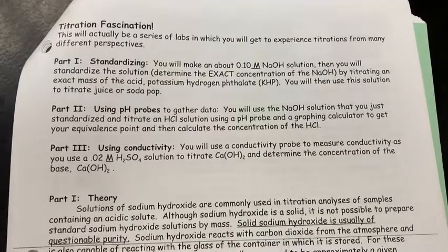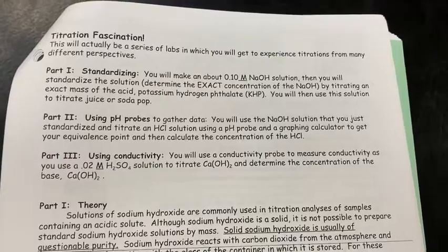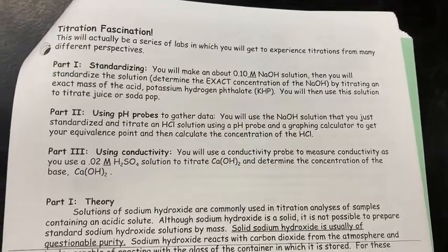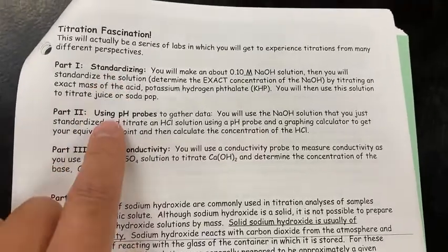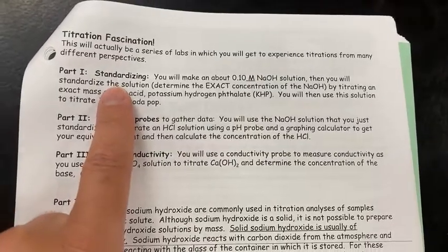Welcome back to Lab, AP Chem students. Today we are going to be starting the first part of our Titration Fascination lab. So the next couple of labs we are going to be doing are going to be going through the three different parts of titration. We're going to start today with standardization.